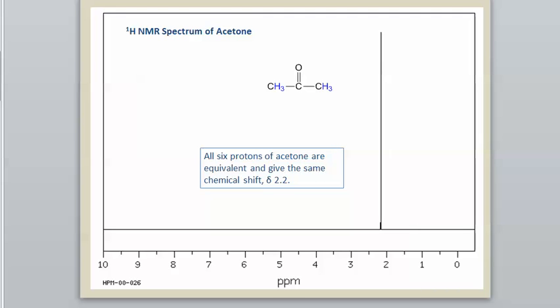These next few slides show some NMR spectra along with the structural formula that they correspond to. So this is designed to get you used to looking at the graph itself and associating it with certain chemical structures. Eventually the idea will be, if you know what atoms are in a molecule, the NMR can be used to figure out how everything's connected, what class of compound it is, and the details of where all the carbons and hydrogens and oxygens and so forth, how everything's connected.